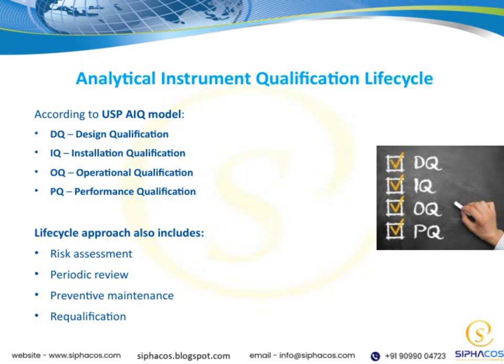By following this life cycle approach, we create a robust framework that not only qualifies our instruments initially, but also maintains their performance and compliance throughout their entire operational life. This comprehensive strategy is essential for ensuring data integrity, product quality, and regulatory compliance in our work.